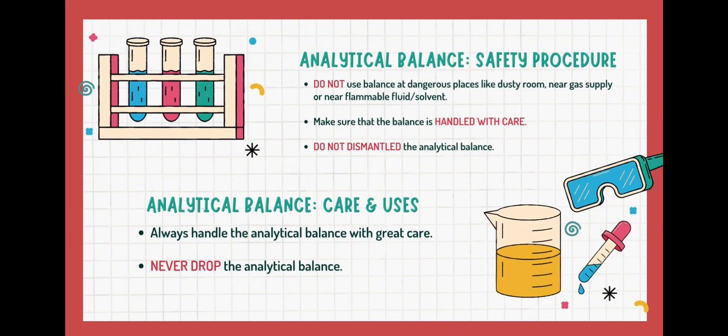Next is analytical balance care and use. Always handle the analytical balance with great care. Never drop the analytical balance.